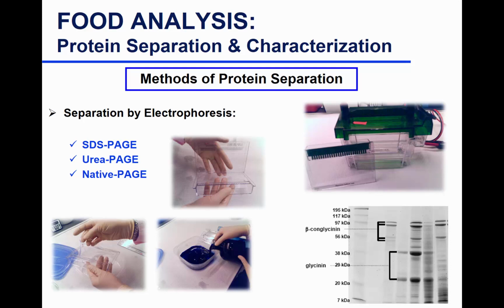Okay, so I'm going to show you what the gel looks like. I'm so excited. I haven't done that for a while. At least I do it once a year in food analysis.